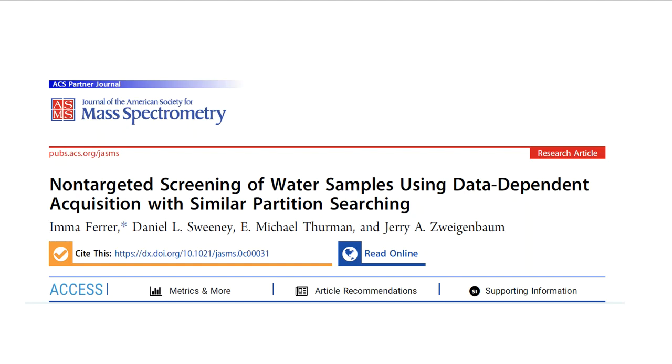30,000 of these MSMS spectra were imported into an Access database that is freely available on Mendeley. In this video, an analyte that was not in the screening database will be identified using substructure searching with the Excel add-in.